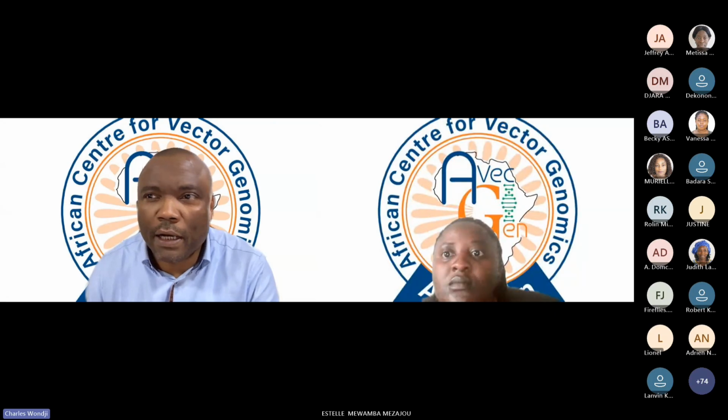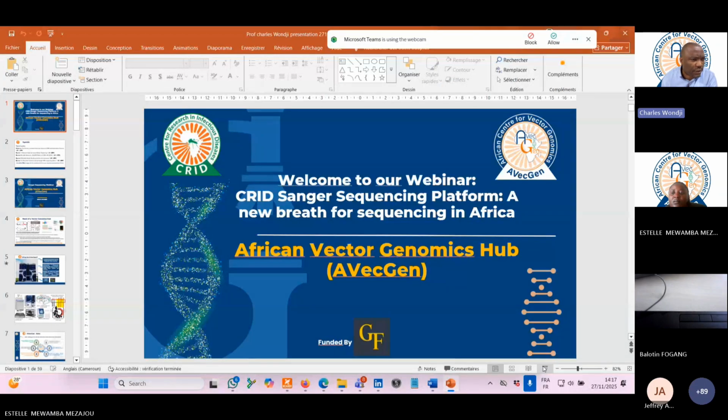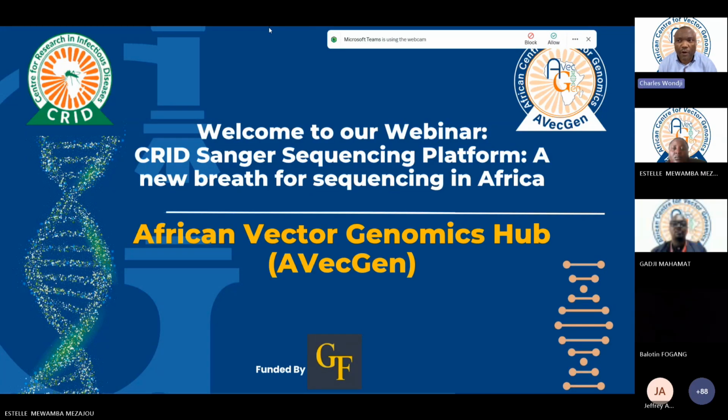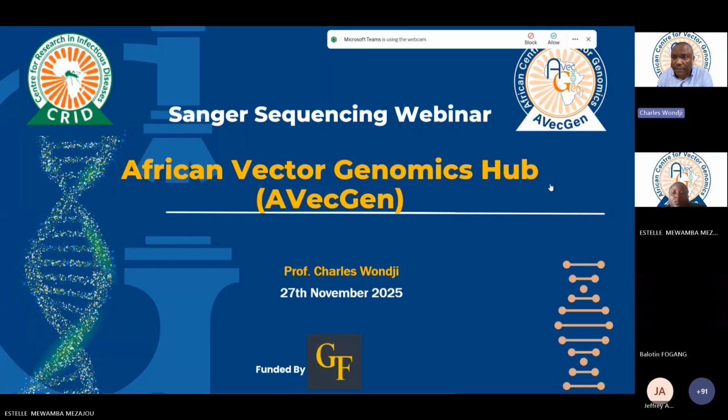We have a question from Grégoire Sawadogo. I imagine that it's from Burkina Faso, but I might be wrong. The question was, thanks for the nice presentation. This is really progress, having a sequencing facility. So in terms of collaboration, how do you manage the shipping challenges? I think that was before the presentation from Murielle, and you got an answer when she presented the way you should prepare your samples for safe shipping, keeping the cold chain.